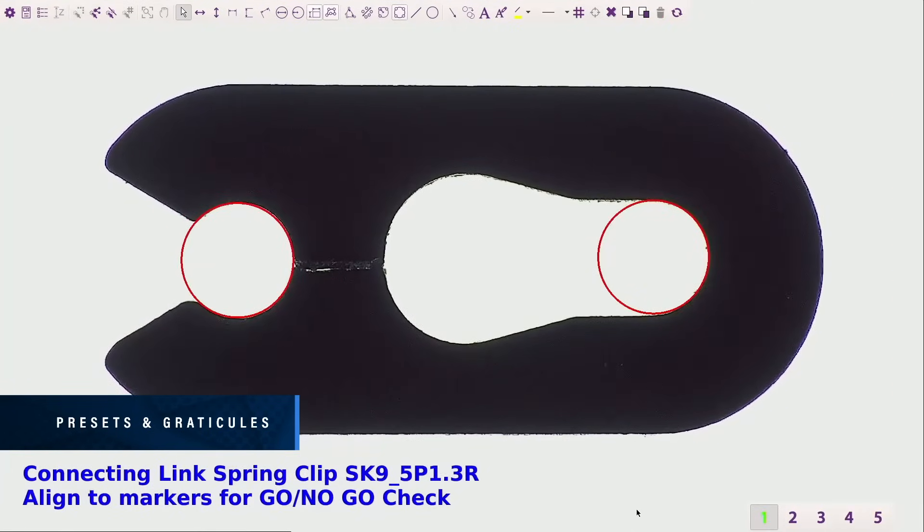On-screen overlays enable the go, no-go rapid inspection of samples.